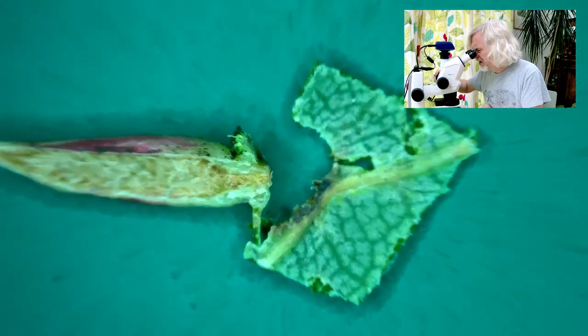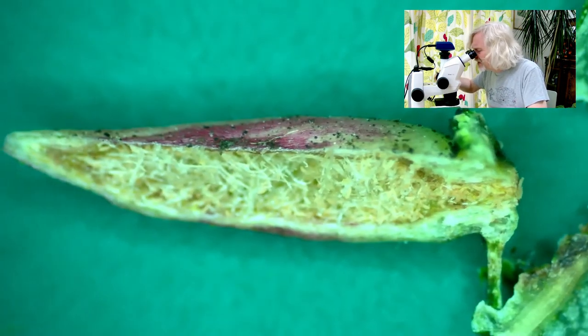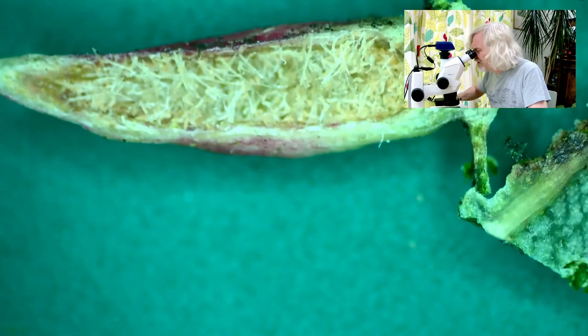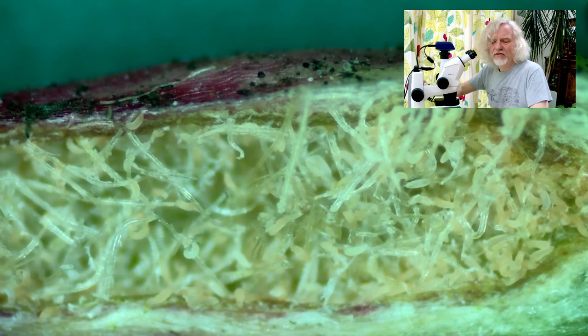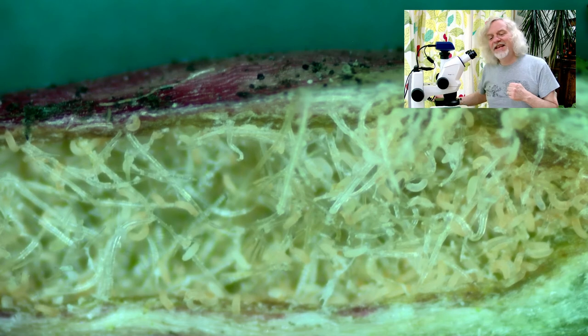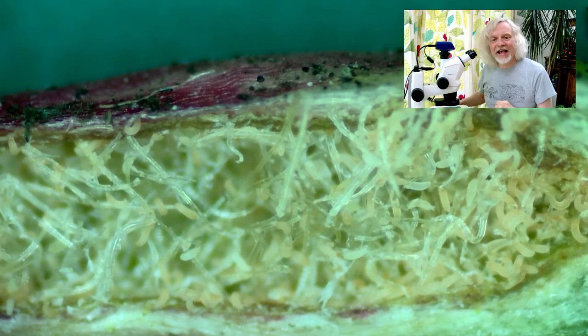So I'm going to zoom back in on this. If I can get this lying a bit flatter, then we'll get a sort of a top-down view of it. And then we'll zoom right in, and you can see all of their wriggly grossness. There they are, wriggling away like crazy inside the lime nail gall. Eriophyes tiliae. So there you go.